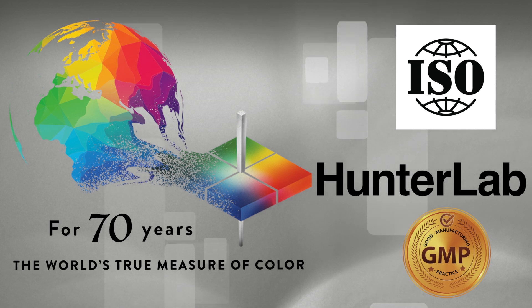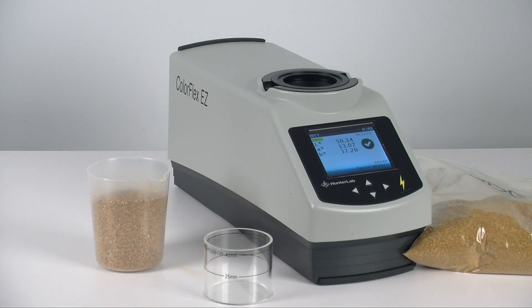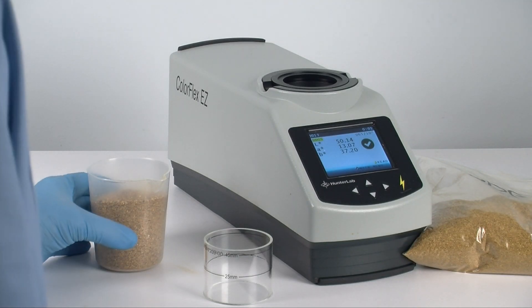Hunter Lab has been trusted by the food industry for color measurement solutions for 70 years. The ColorFlex EZ is incredibly quick and easy to use. Let's take a look.